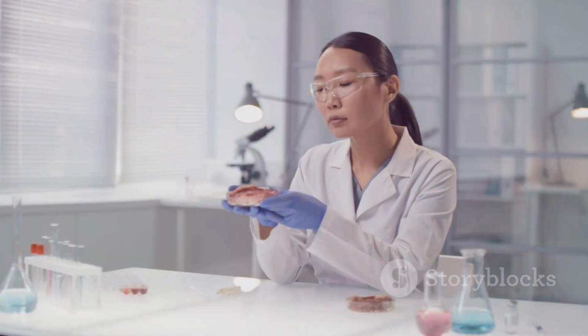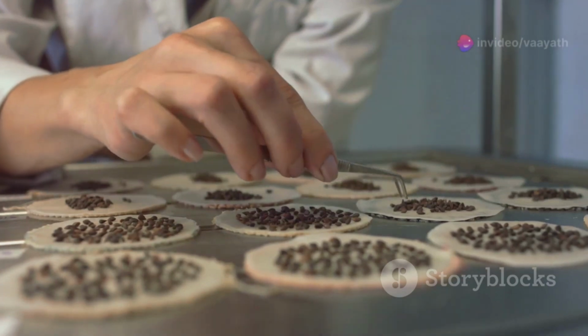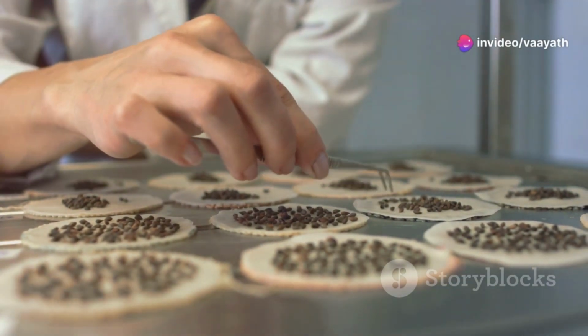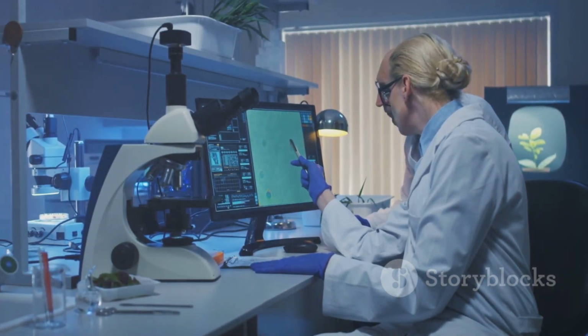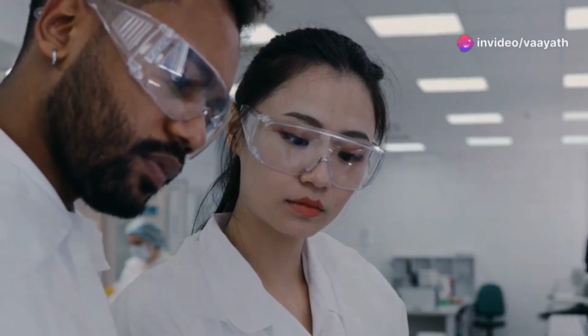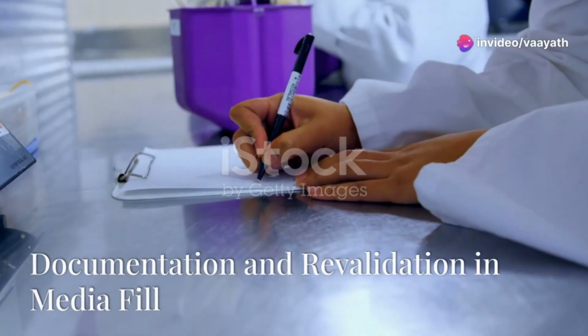Microbiologists meticulously inspect each container, carefully documenting any signs of growth. In cases of suspected contamination, further tests are conducted to identify the specific microbe present. This thorough analysis helps pinpoint the source of contamination and allows for corrective actions to be taken. The results are then compiled into a comprehensive report, providing a detailed account of the media fill study.